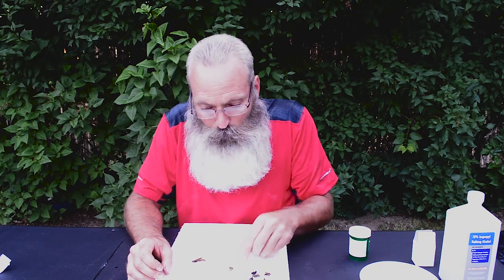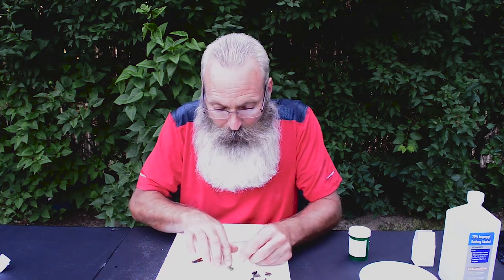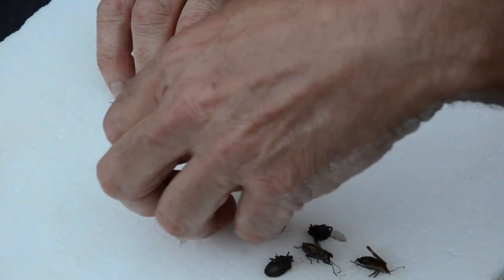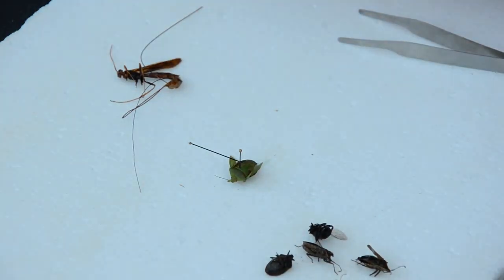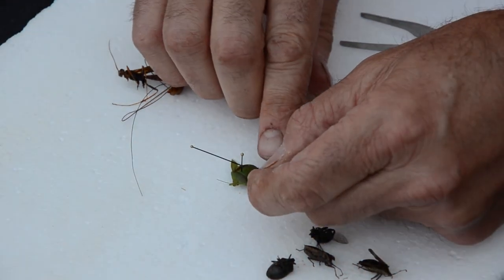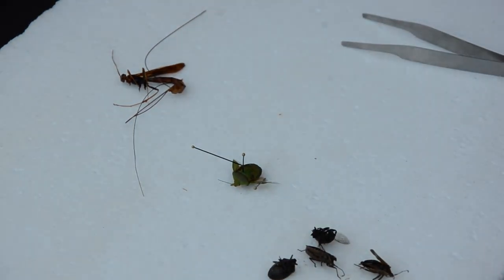If you have legs or wings that are not in the right position and you want to move them, you can do that pretty easily — just by taking the pin and holding the wing in the position that you want. Let it dry. Then say a day or two later, you can remove the pin and the legs or wings will remain in that position.